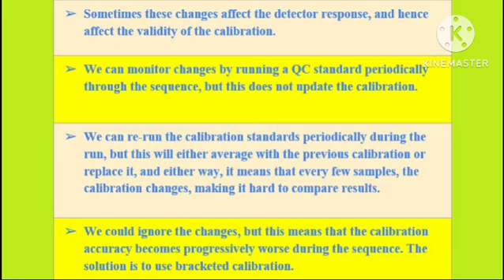In this analysis, we analyze the standard and bracketing standard with the test sample. We analyze the standard to find out the area of the standard. With this we can determine the assay. But what is the purpose of the bracketing standard in analyses like HPLC, GC and UV? Do we run this bracketing standard before the analysis or after completing the analysis? For all these questions, I will give you the answer.